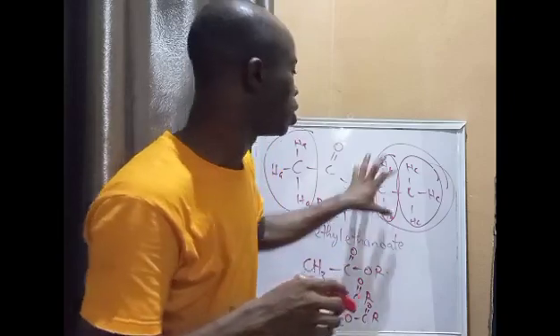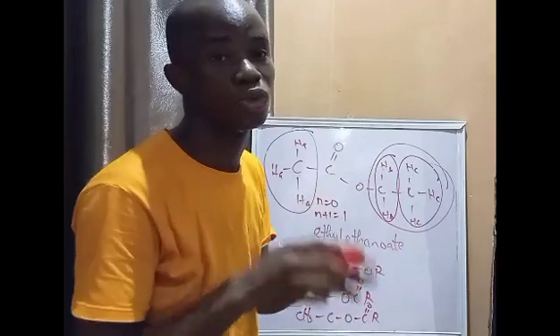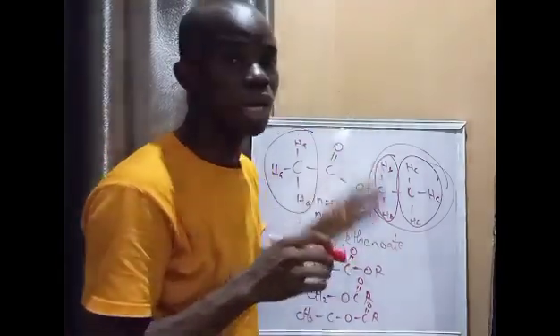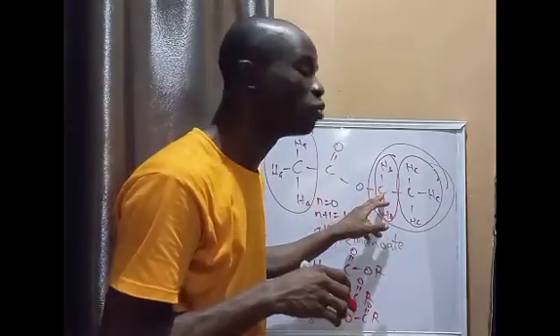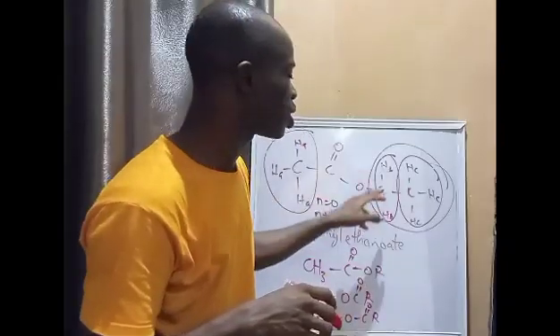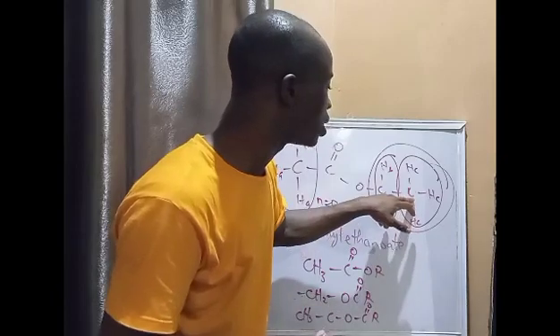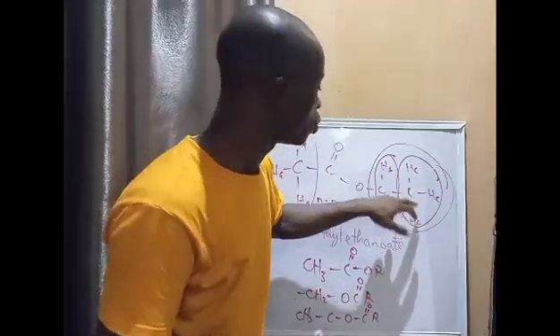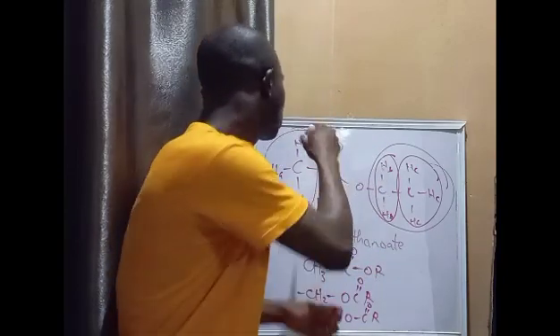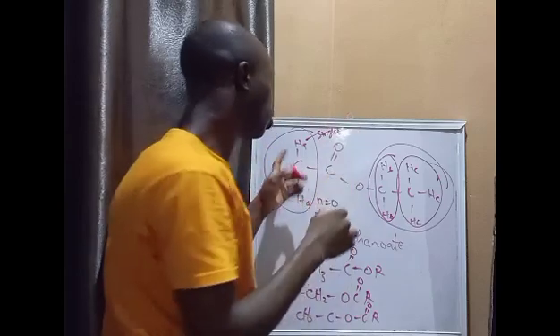That's what that implies. Now, if you look at these two protons that are also producing one signal, to determine the multiplicity of their signal, I have to consider the adjacent carbon to this particular carbon that is carrying the 2Hb. So the only adjacent carbon to this carbon is this one, which is carrying three protons. So this one, like I said, is the singlet, because the multiplicity is 1.